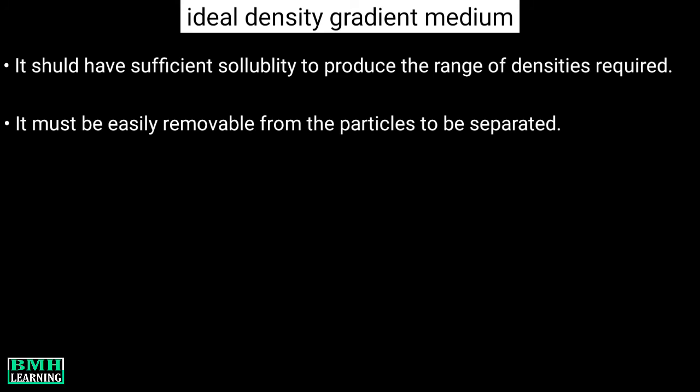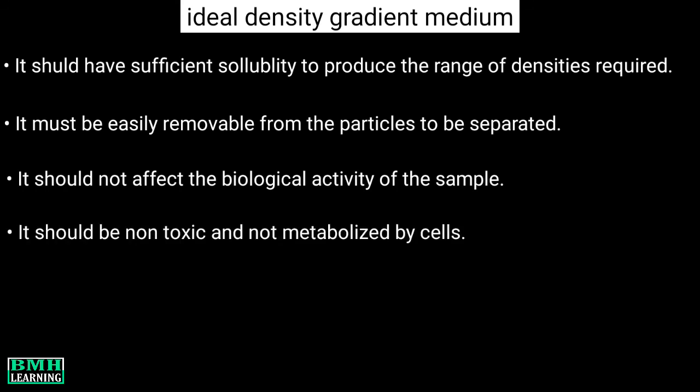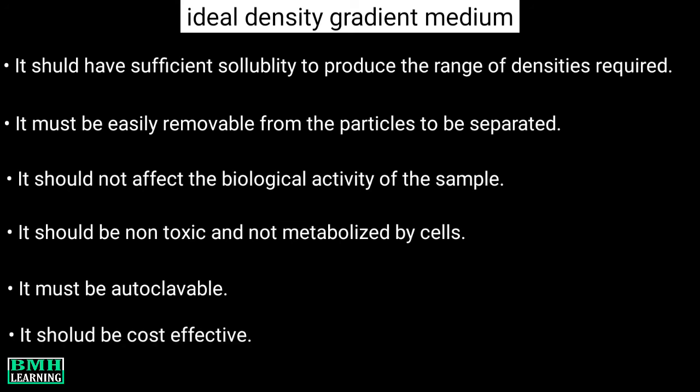It should have sufficient solubility to produce the range of densities required. It must be easily removable from the particles to be separated. The medium should not affect the biological activity of the sample. Also, it should not be toxic and not metabolized by the cells. The medium should be autoclavable. And last but not least, it must be cost effective.